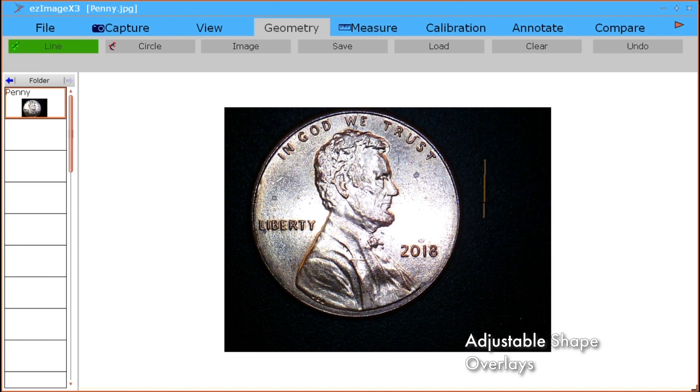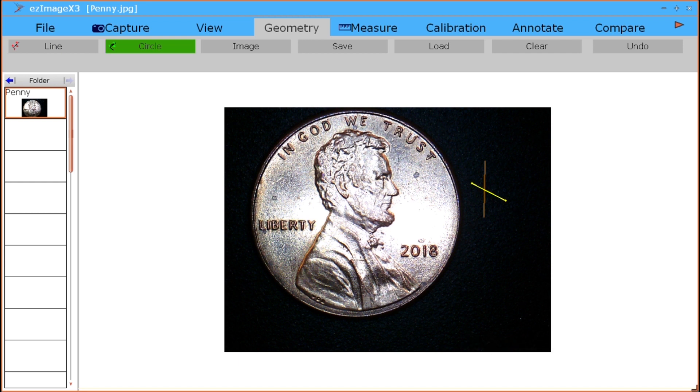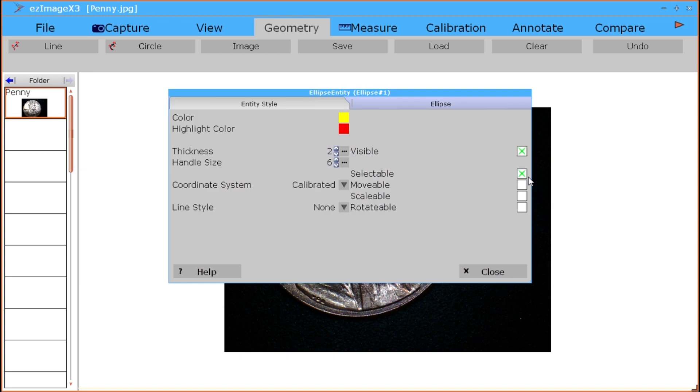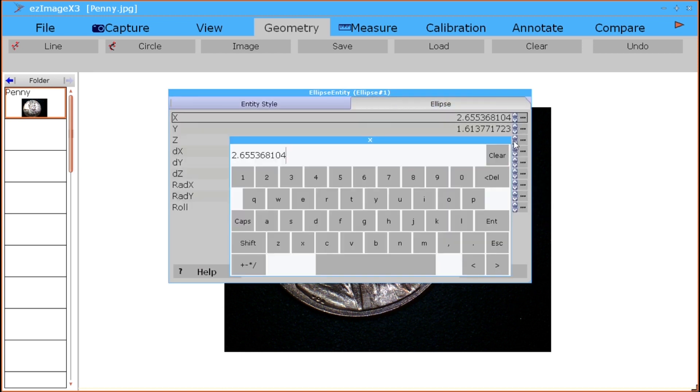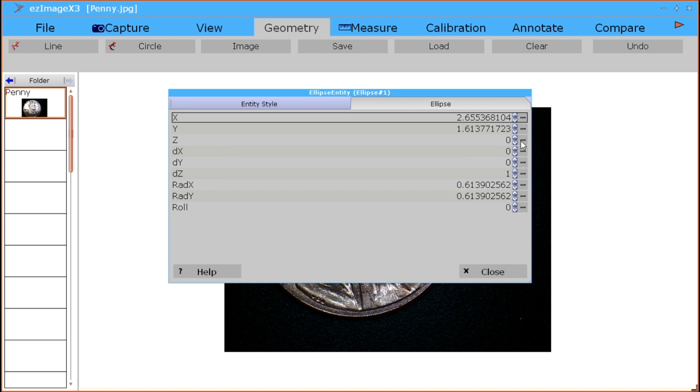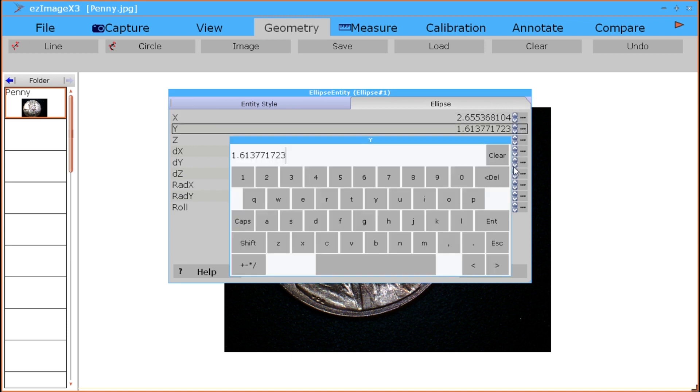Adjustable overlays. Line and circle overlays can be adjusted by accessing their edit menus. Once a line or circle is drawn, simply right-click on the line or circle to access these menus. These overlays can be saved and loaded again for future applications.